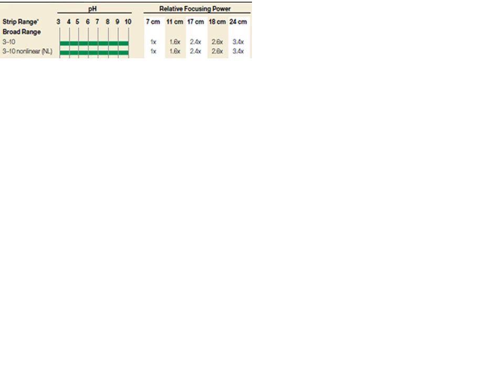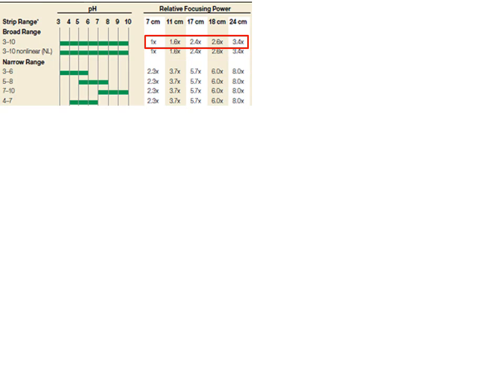To further increase the resolution of protein isoforms from other proteins, there are a number of things that can be done. One could simply make the IPG strip longer, spreading the proteins out over a greater distance. But larger gels can be difficult to handle. Instead, an IPG of the same length can be used but with a shorter pH range, such as this 2.3-fold increase in resolution that you gain using a 7 cm strip by narrowing the range from pH 3 to 10 to pH 5 to 8.